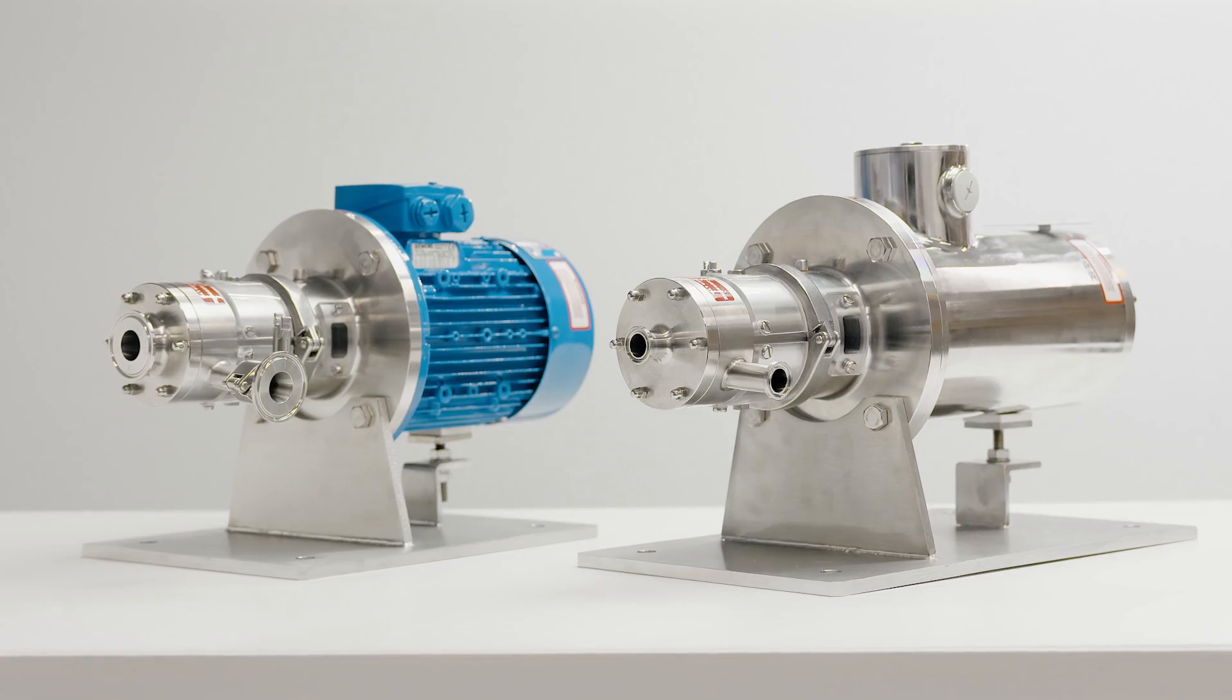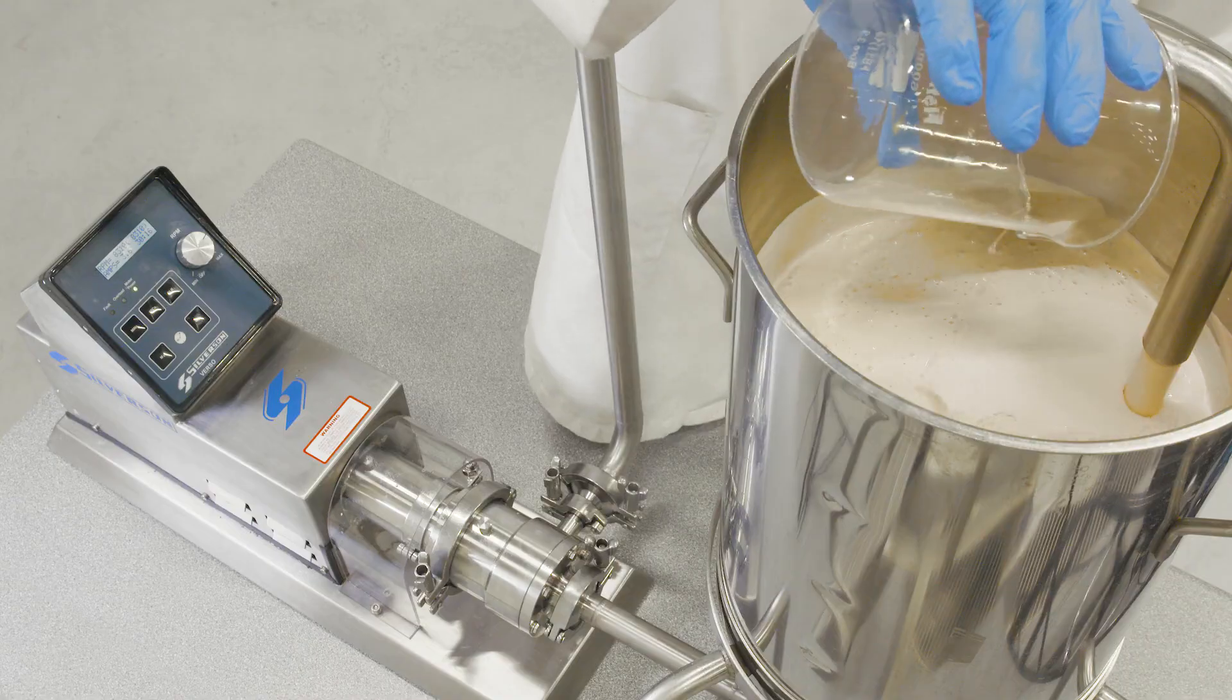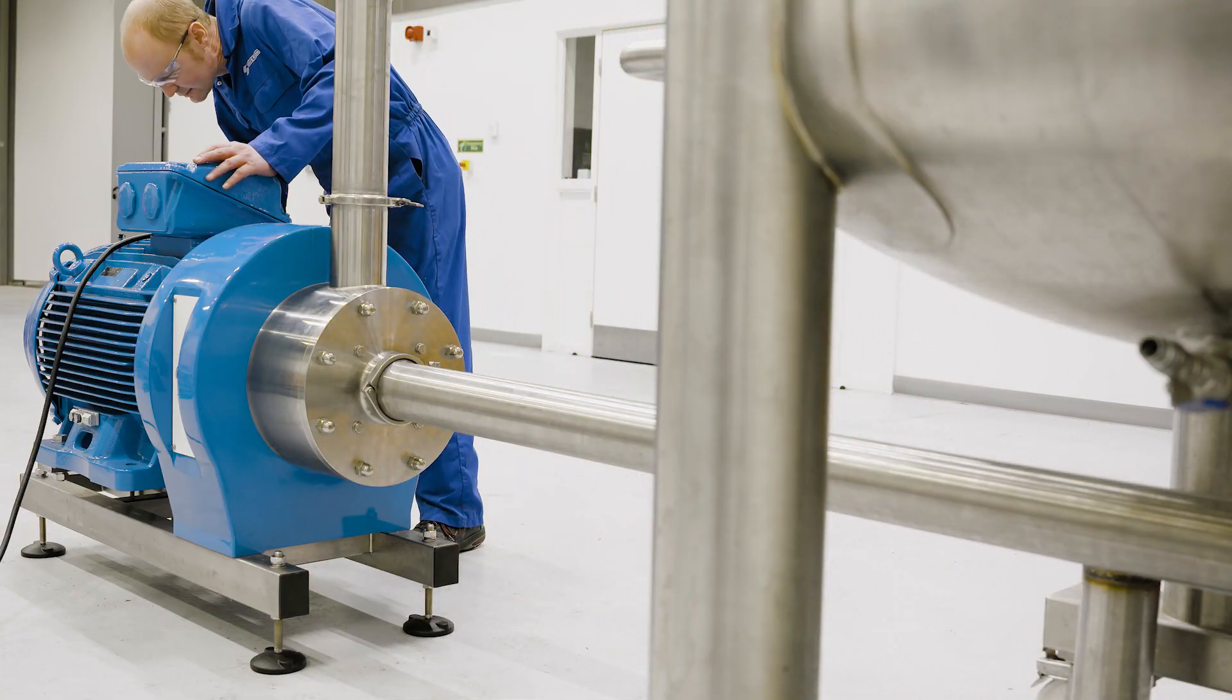Silverson's new range of specialized small-scale inline mixers bridges the gap between laboratory models and large-scale mixers currently available in the Silverson product range.